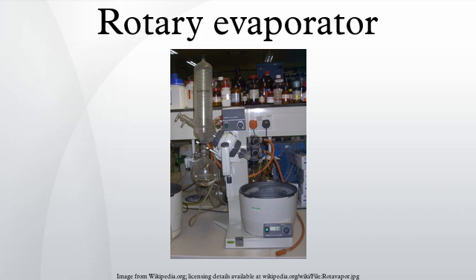The key advantages in use of a rotary evaporator are that the centrifugal force and the frictional force between the wall of the rotating flask and the liquid sample result in the formation of a thin film of warm solvent being spread over a large surface. The forces created by the rotation suppress bumping. The combination of these characteristics and the conveniences built into modern rotary evaporators allow for quick, gentle evaporation of solvents from most samples, even in the hands of relatively inexperienced users.